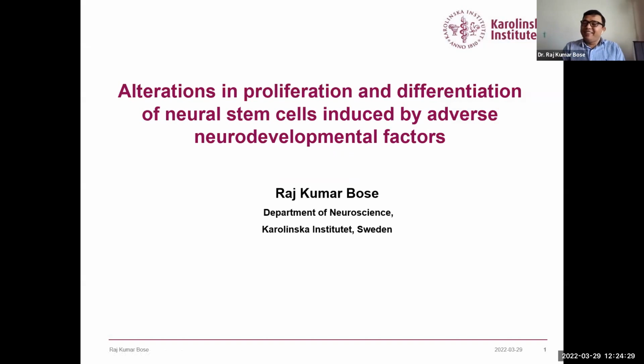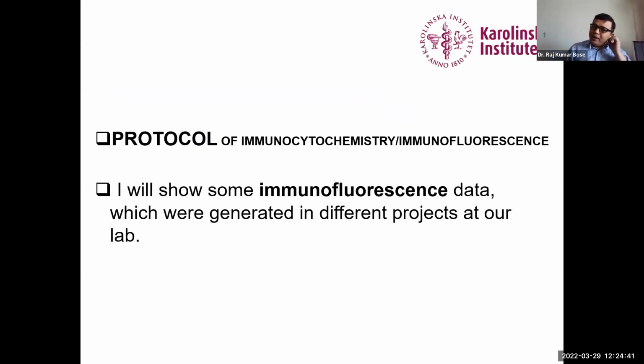Thank you, Professor Mollik, and thank you all who are listening to me. It's my pleasure to be in this session. And this is the title of my talk today. First of all, I would like to mention that I prepared all slides for beginners to this technique: how to use it, how to look carefully at all the critical steps, and how to handle troubleshooting when you use this immunocytochemistry technique. Then I will show some immunofluorescence data generated in a different project at our labs.